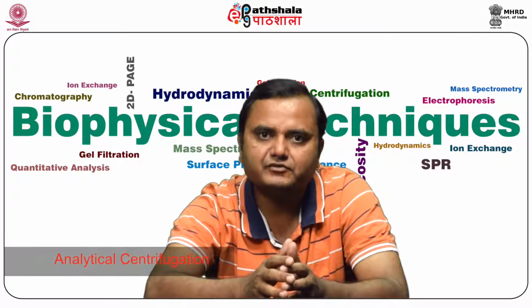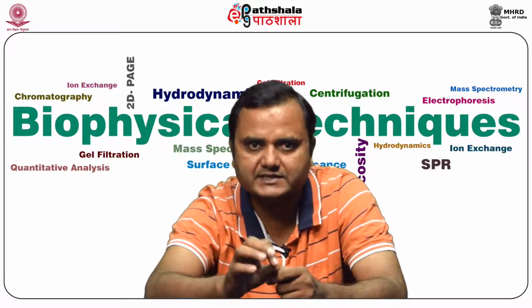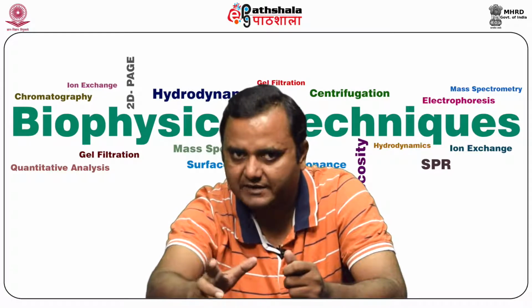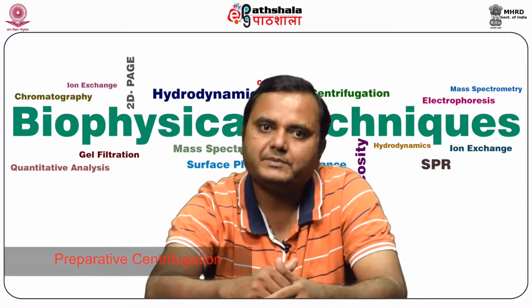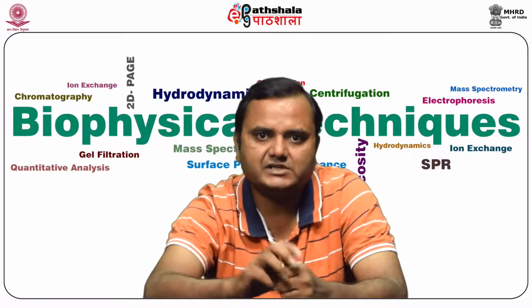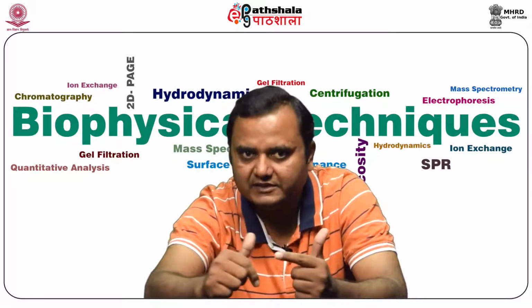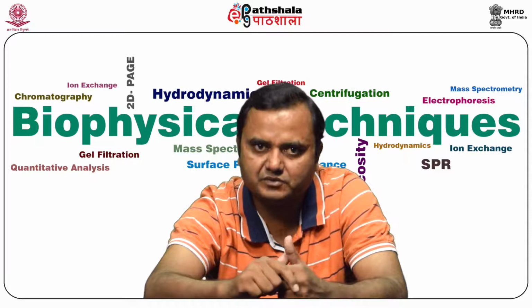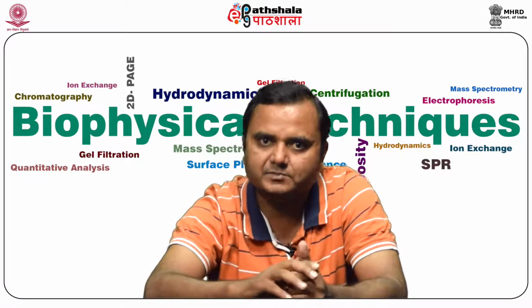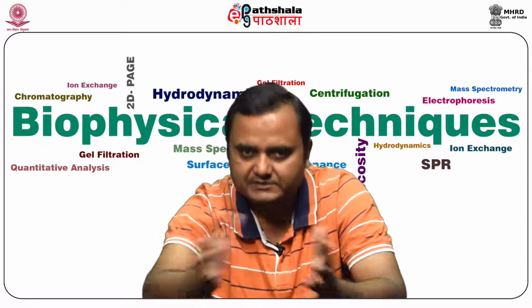First is analytical centrifugation. Analytical centrifugation involves measuring the physical properties of the sedimenting particles such as sedimentation coefficient, molecular mass, binding capacity and many other parameters. The other is preparative centrifugation. The objective of preparative centrifugation is to isolate a specific particle which can be further reused. That is the main difference between analytical and preparative centrifuge. In analytical, the particle may or may not be utilized further, but in preparative centrifuge, that substance or particle may be further utilized for other purposes.